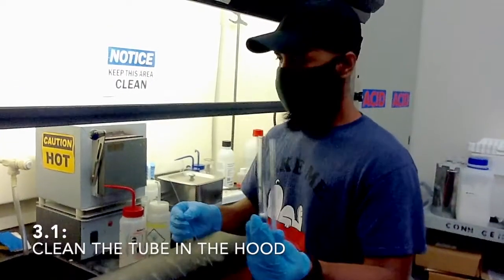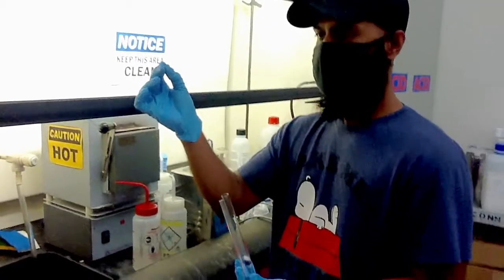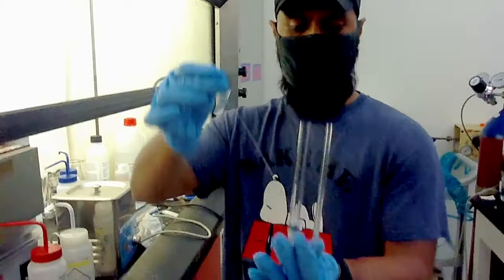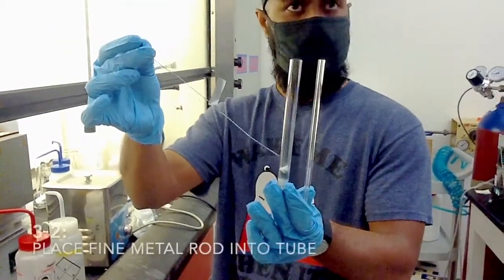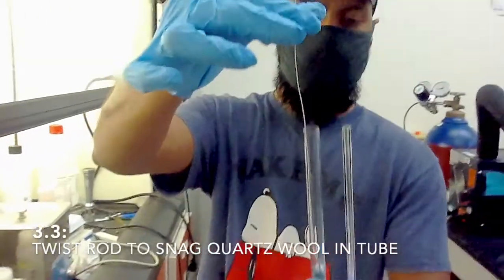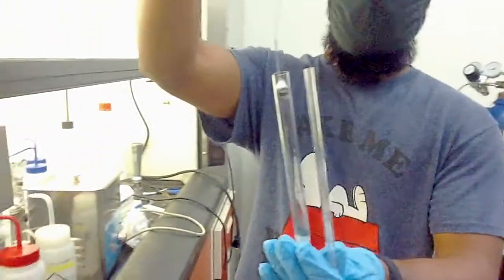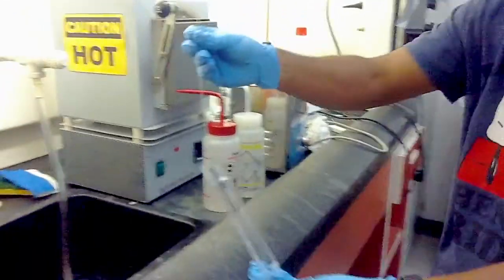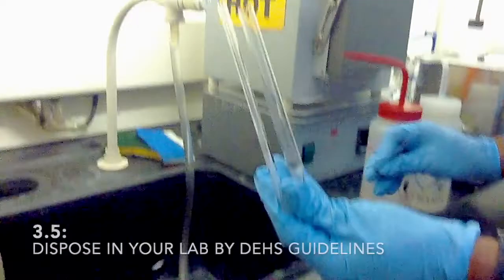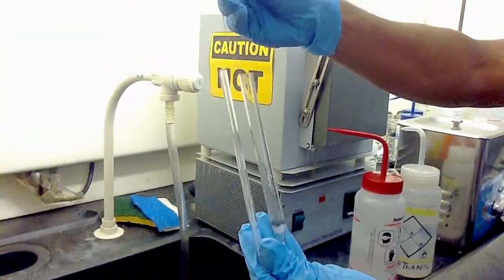So bring the tube into the hood to clean it up. There is one metal piece which we will use to take out this quartz and your sample. So put it in here. Try to twist it a little bit so it will grab this quartz wool, and try to keep it in here so that it will not fly. And leave it here. Do the same thing once again.